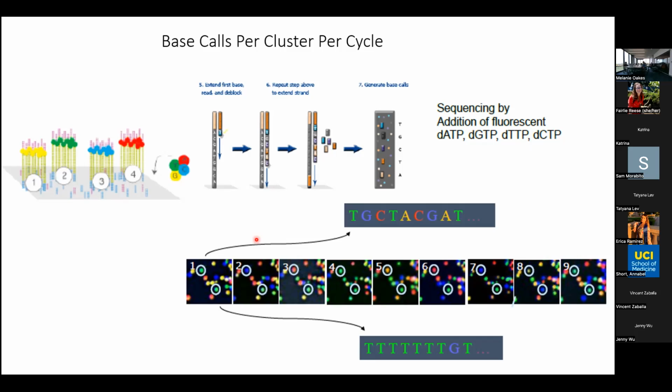Question here. So if you are running 35 cycles, meaning from one end, let's say read 1, you are adding 35 nucleotides. That's correct. And then typically if you have read 2, your insert size only adds around 70 nucleotides, and if it's longer than that, there's a gap, right? There is a gap. Some people don't care about the gap. Let's just say they're doing RNA-seq. They want to be able to align those 35 and the other 35.